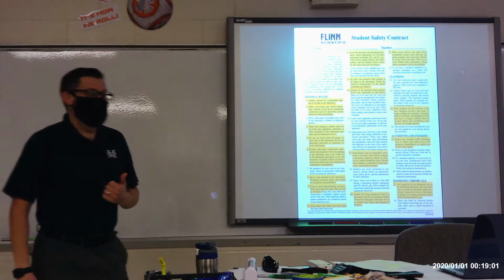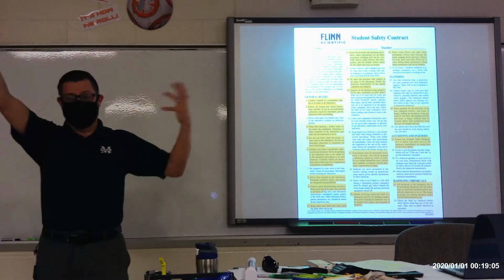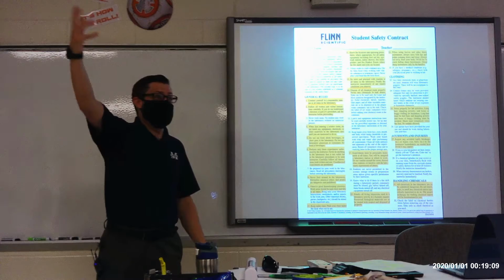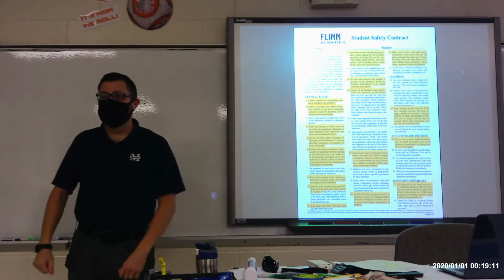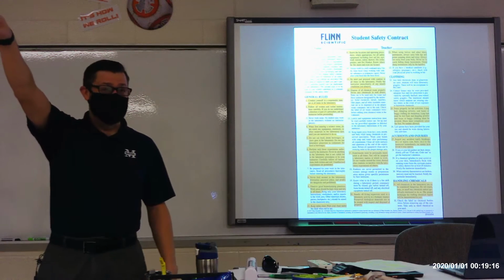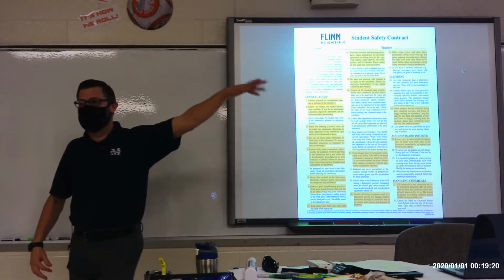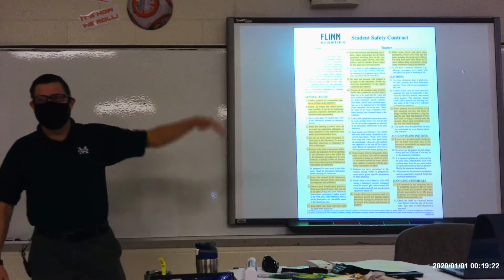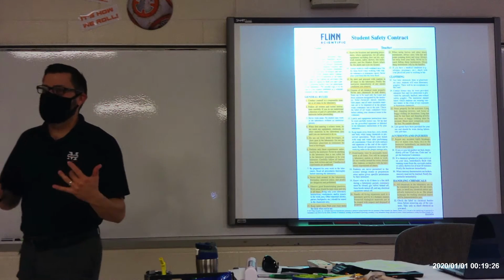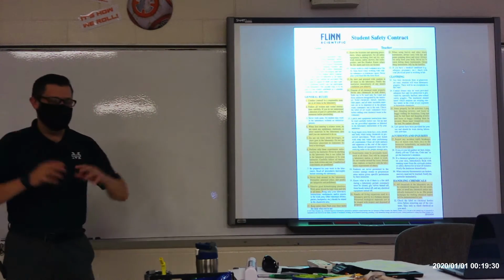In the back, there's a big orange square that says fire blanket. If someone were on fire, the better option would be to grab that and smother the fire. In fact, if there was a fire in this classroom, I would go for the fire blanket first, before the fire extinguisher, because the extinguisher is going to be far more messy and problematic. And again, this is a biology class. We're not going to have much occasion for setting things on fire. Go next door into the chemistry class if you want any of that.